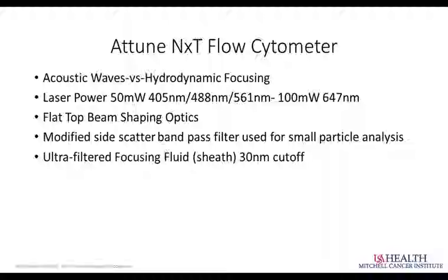So the slower you go, the longer, and of course we're talking microseconds, but it's enough to make a difference in the amount of photons that can be captured. So running slower in this system really does increase the sensitivity in that you can collect more photons from each particle and see a brighter signal.